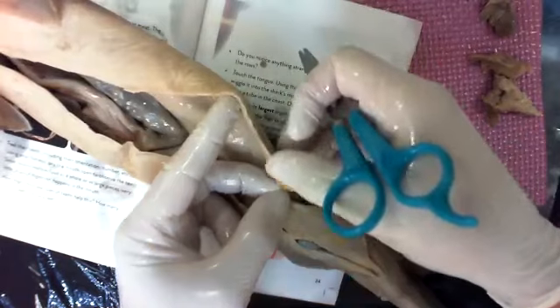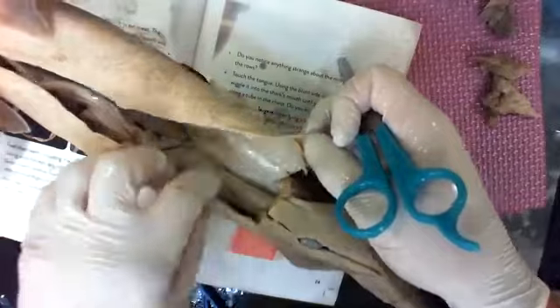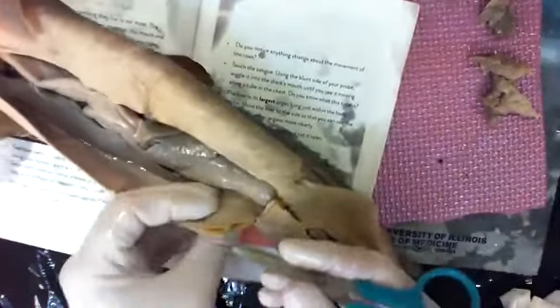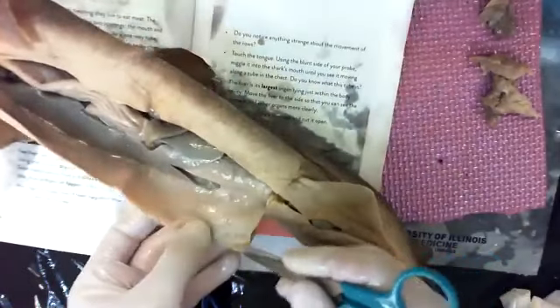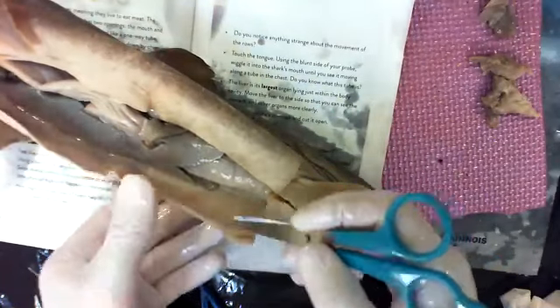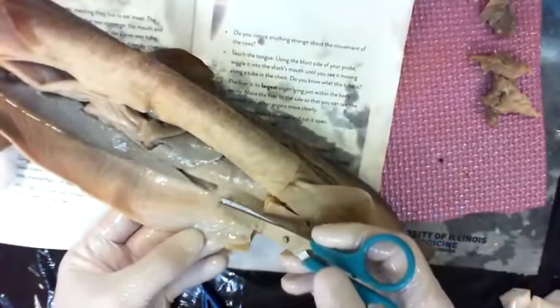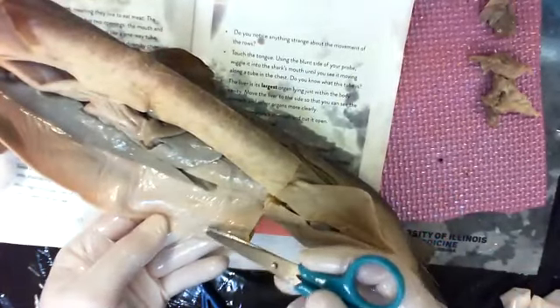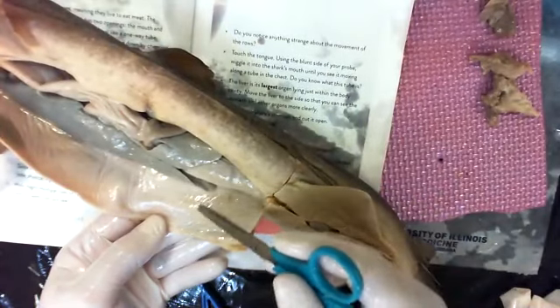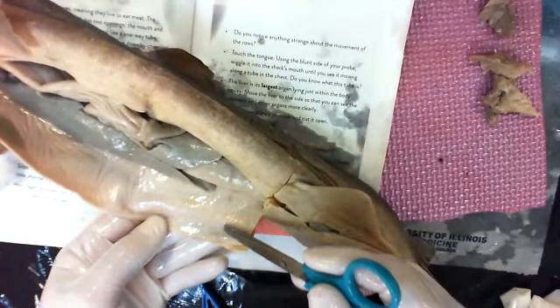But if you want later, you can separate these. You can see the muscles. You can see the direction of the muscles. See them over here. You can see the layers. You can see a blood vessel there. See it right there? There's another blood vessel. So these are actually called the lateral vessels. There's one here and one here because this one sits on this side. I just didn't cut it down the center very perfectly. So the center line would have been right here where they're both equally distant from the middle.